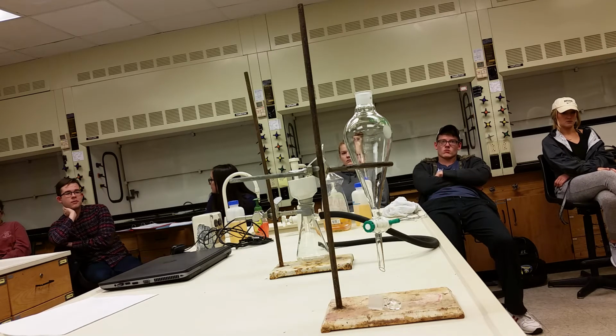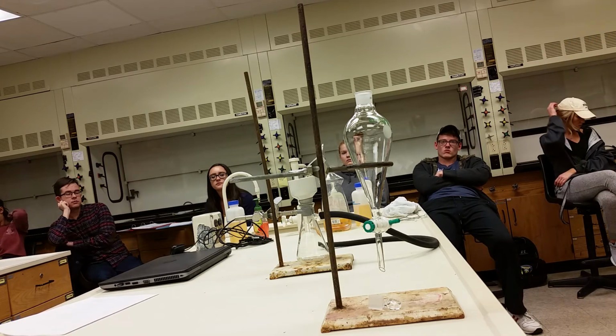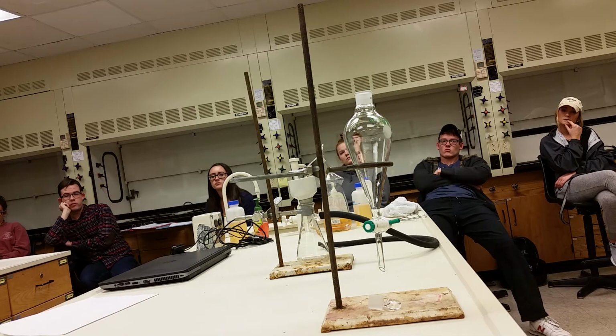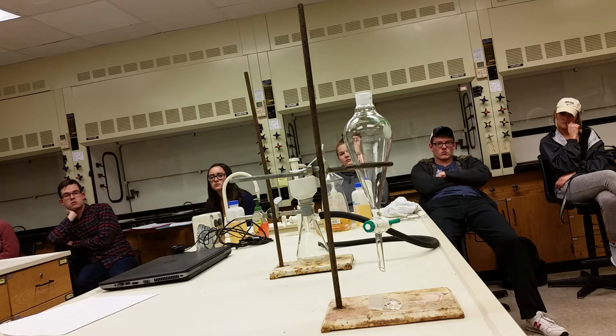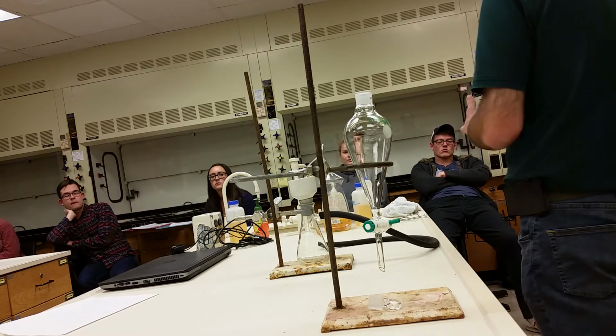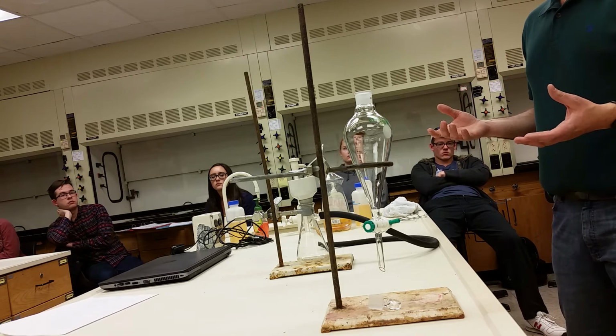In order to get back anything that's dissolved in the sodium bicarbonate or sodium hydroxide layers, you need to add acid to reclaim those. You'll do that by doing a drop-wise addition of 6 molar hydrochloric acid. Basically, you do that until you see no more solid precipitate form.